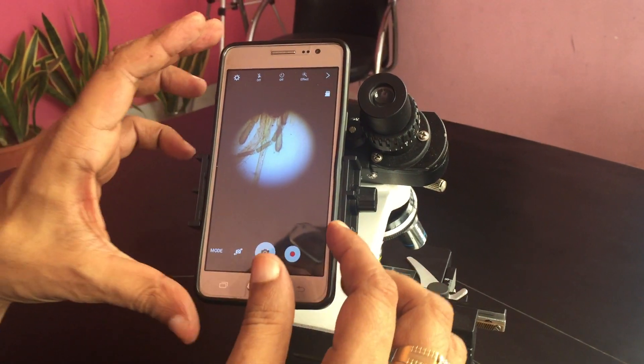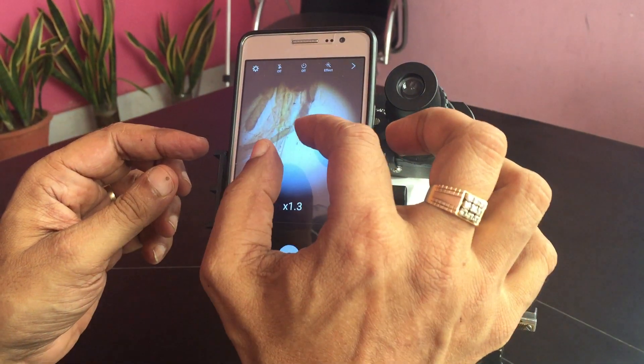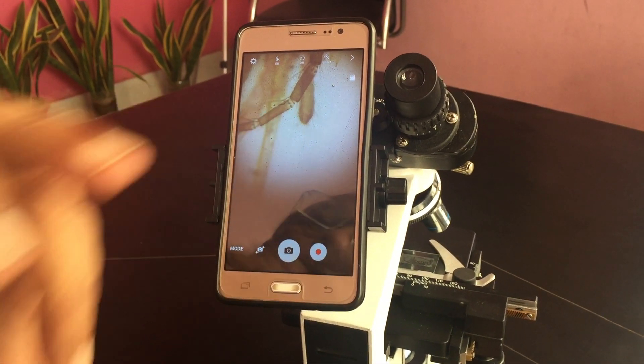This is a new adapter for iPhone or any phone. You can just put it, see this — you can focus it and make it bigger, then focus by the microscope. You can see this is focusing the lower part, focusing the upper part, focusing — see this different things. Very easy to use.